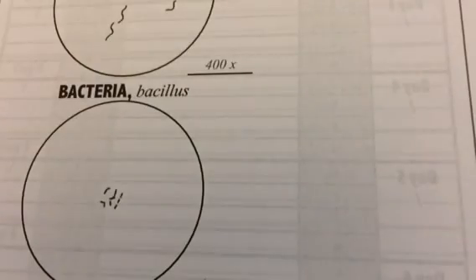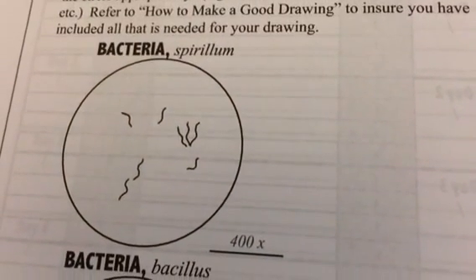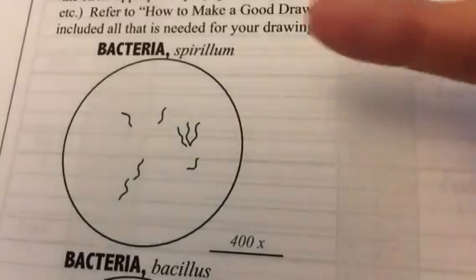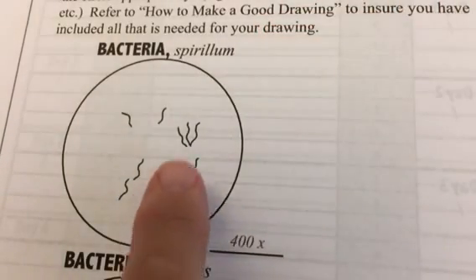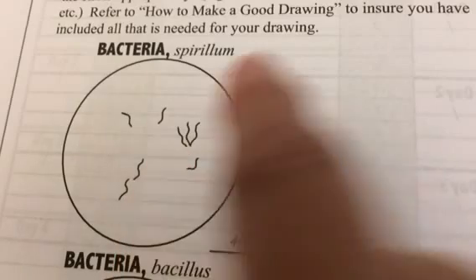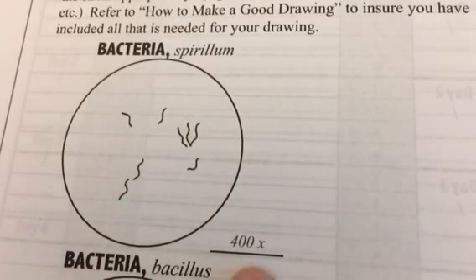I'll show you a picture of page 54, which I did show you in class today, but just in case you don't like your drawings, you can take a look at these. Make sure your drawings are labeled. Here's an example of spirillums. They look stringy or spirally, like little snakes. And that's at high power.